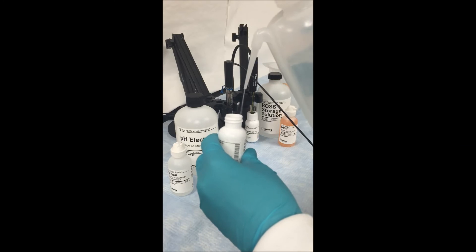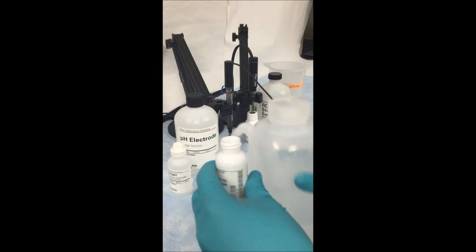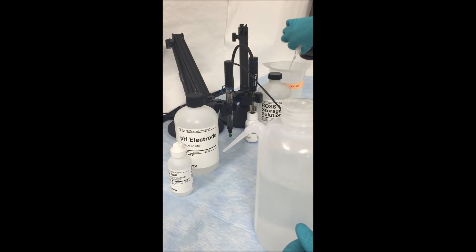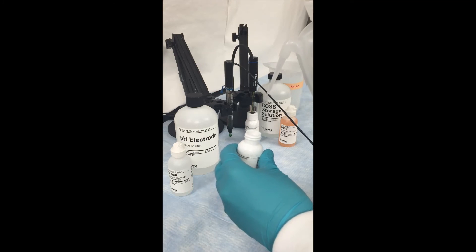To do this, dump out your original storage solution and rinse out the storage bottle with some deionized water. Make sure you rinse it out multiple times and swirl it around to remove any old storage solution.